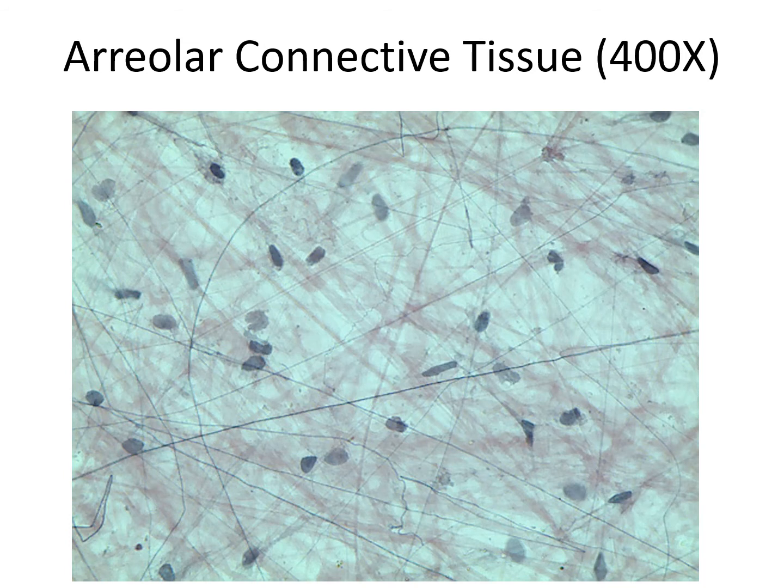Areolar connective tissue. Well, I think this is the one that is easy to recognize. So you see lots of fibers, and those darker fibers. Let's start with dark. Those are elastic, right? So here's the elastic fiber, and this one you see like dark.